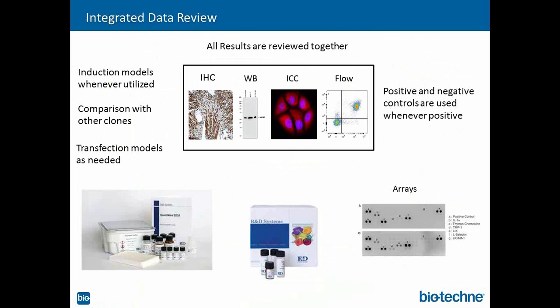And then we get back together and we look at all the data across all applications with a group of very senior scientists here in-house. And we're literally then reviewing every single clone result and making sure that the one that we put in the catalog and choose for release is the best one for multiple applications. We're always choosing clones that are meeting each application optimally, but we won't release every clone that was ever positive. So that's a little different.